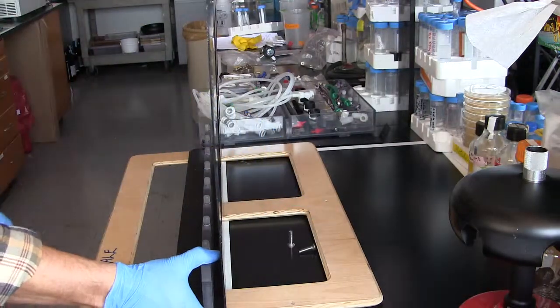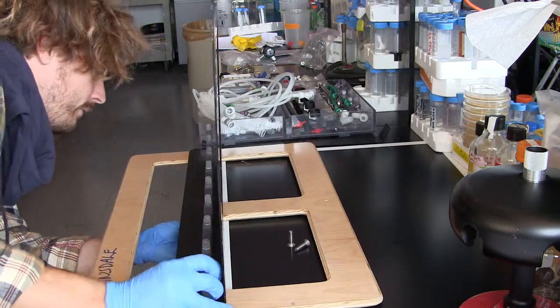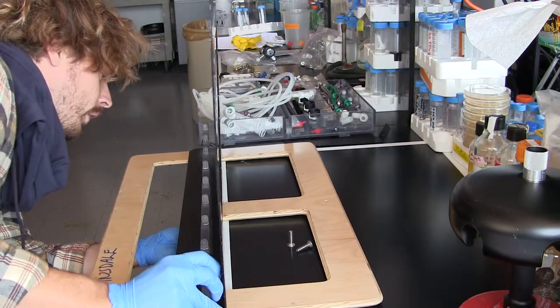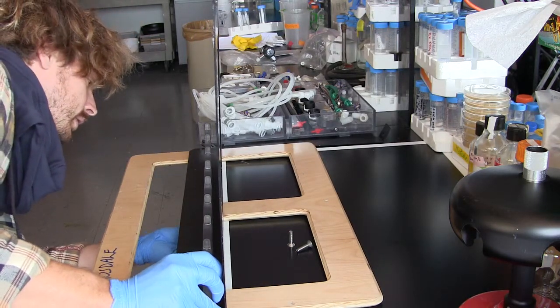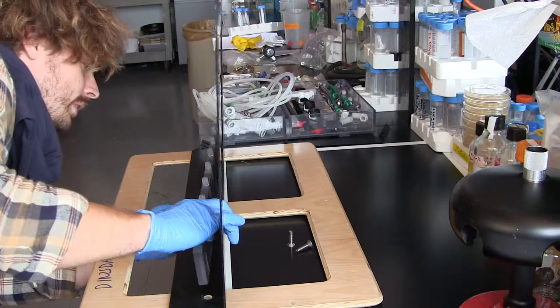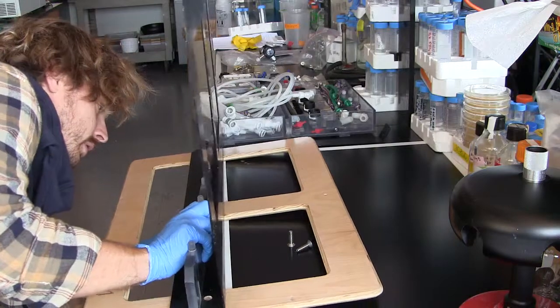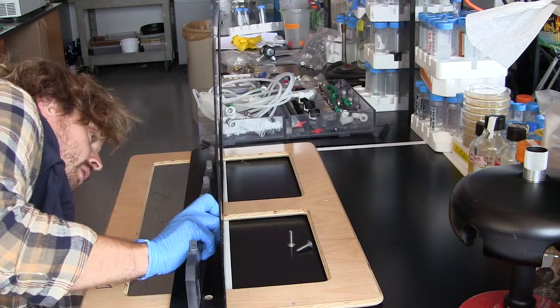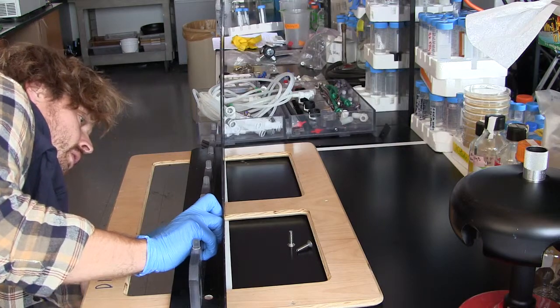Okay, the first thing to do is you then put a bolt up through the center, find where it fits, and then screw it into the hole that's been drilled into this plastic piece in my right hand. Sometimes it takes a little while to find it. There we go. Okay.